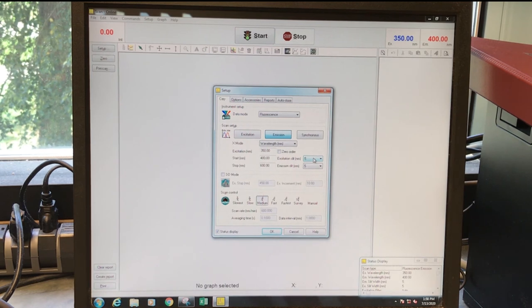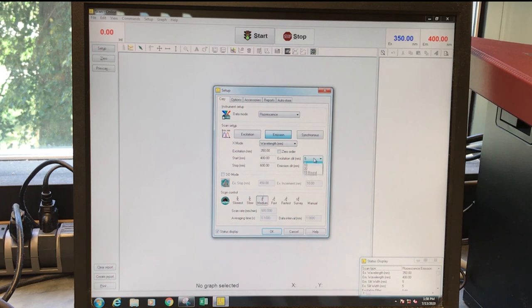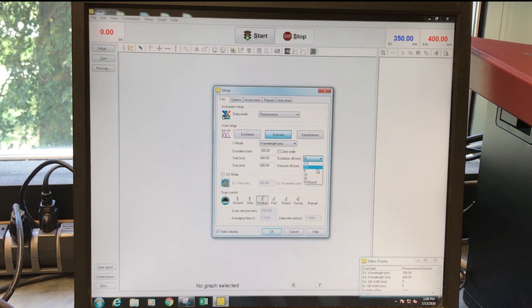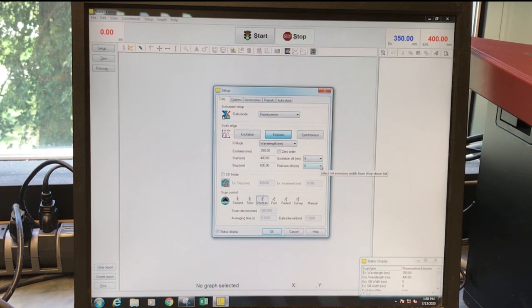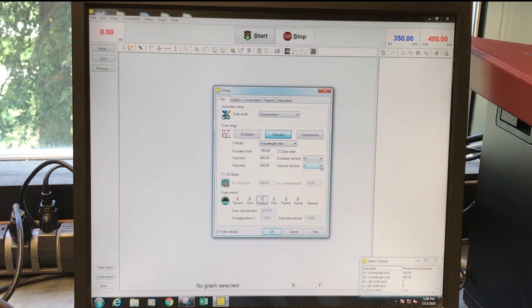may sort of flat line at the top, you can close down these slits, make them more narrow so that less light is hitting the sample and less light is hitting the detector.